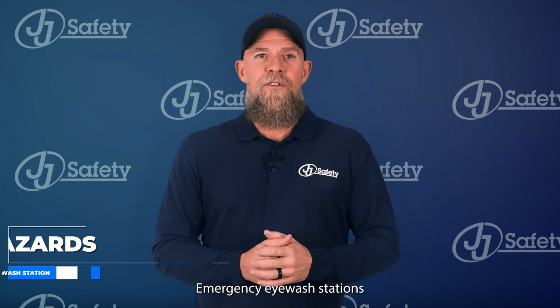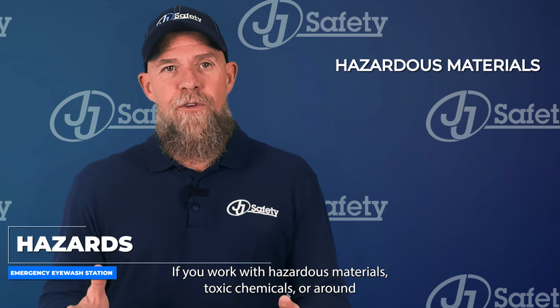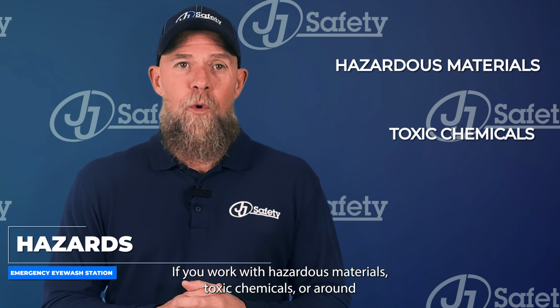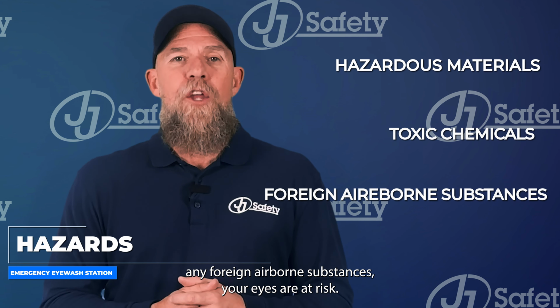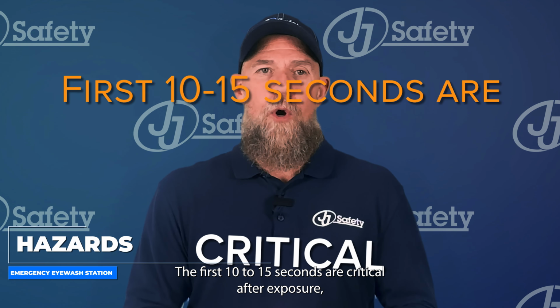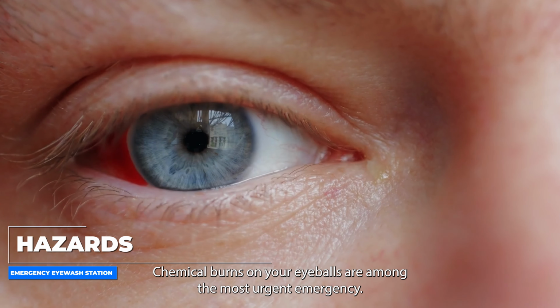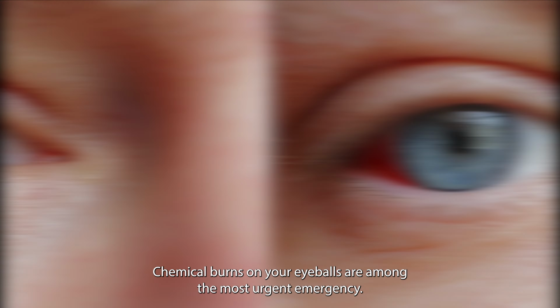Emergency eyewash stations are an immediate way to decontaminate the eyes in an emergency. If you work with hazardous materials, toxic chemicals, or around any foreign airborne substances, your eyes are at risk. The first 10 to 15 seconds are critical after exposure, then permanent damage can set in. Chemical burns on your eyeballs are among the most urgent emergencies.